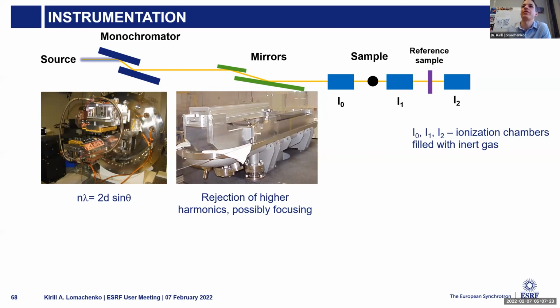So we can use the reference spectra to align the actual spectra of the sample. And this is a feature that is realized very nicely in Athena, the software for data analysis. You can use it there.